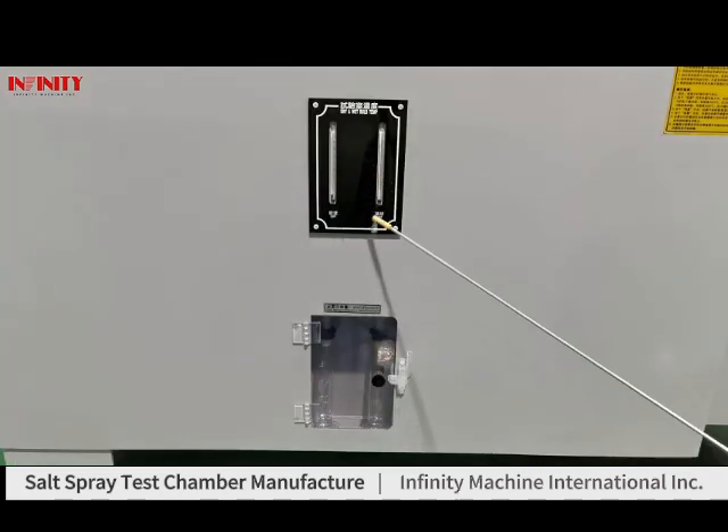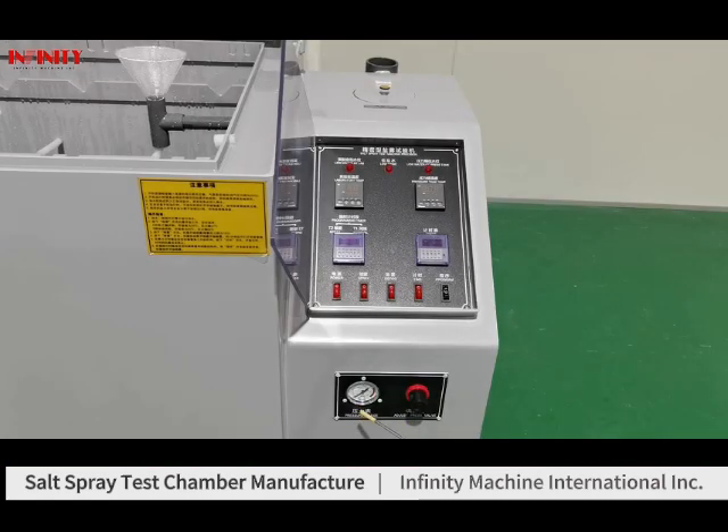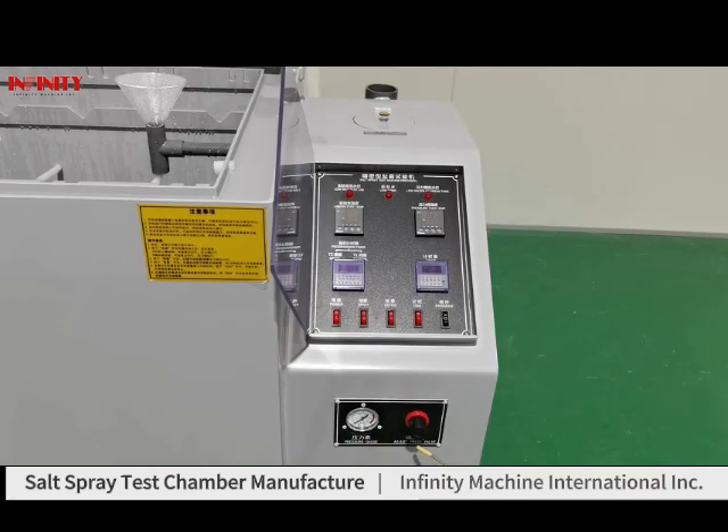This is the dry and wet bulb temperature probe. Inside of the machine they have two pieces of funnels for collecting salt rate. This one is the pressure gauge. And this is the pressure valve.